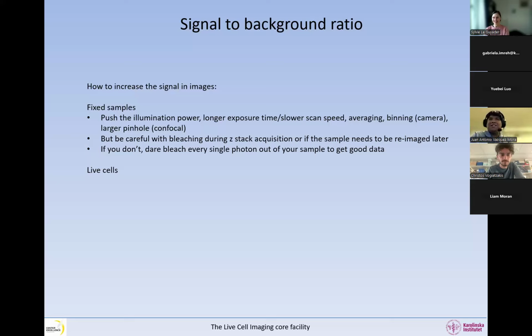Thankfully, I did not bleach the image, but at the moment you don't think that you will need it. You never know, especially when these results are published, there might be a need for re-imaging. If not you, maybe the other person, they wouldn't know how you did it, and maybe you bleached them and they cannot find it anymore, and it will be more difficult to answer. Yeah, I agree with you.